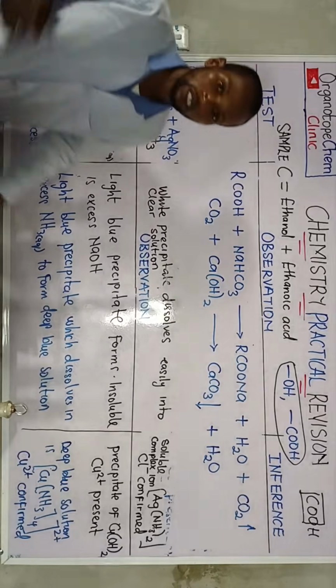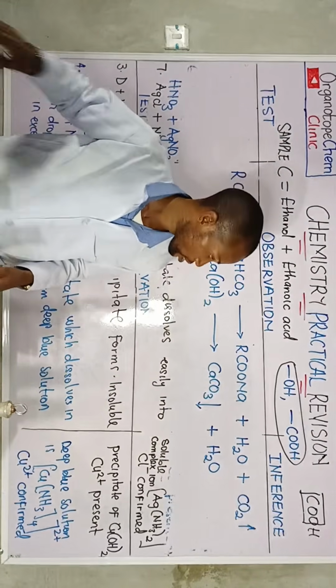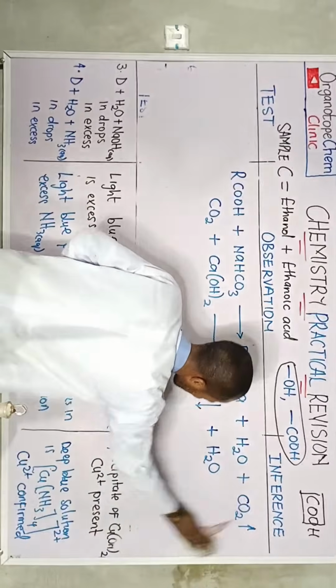All right, let's proceed with the reaction. I hope you can see the board clearly. Let's proceed with the reaction. Test 2. Reaction for test 2.